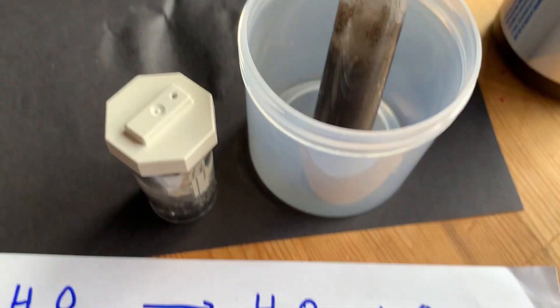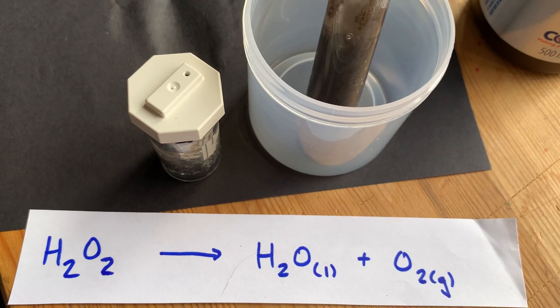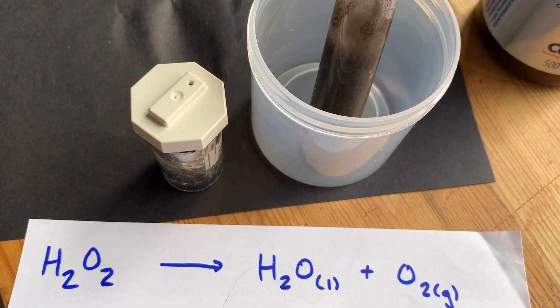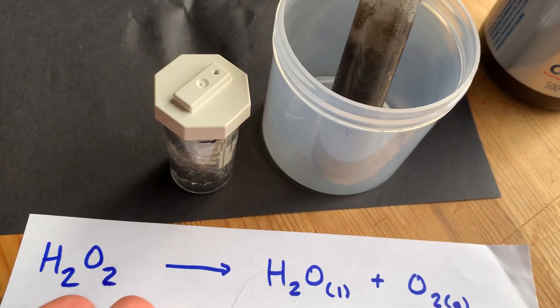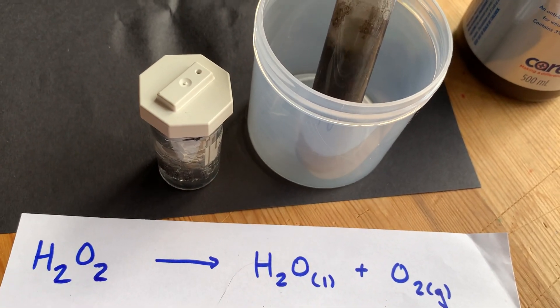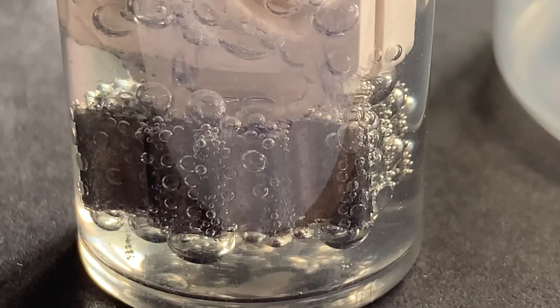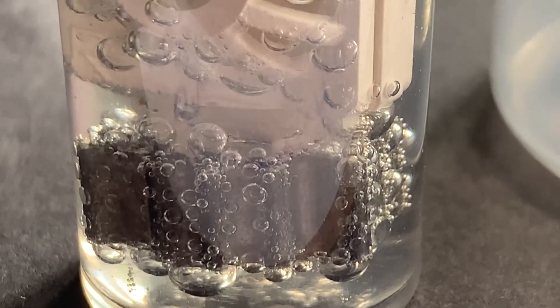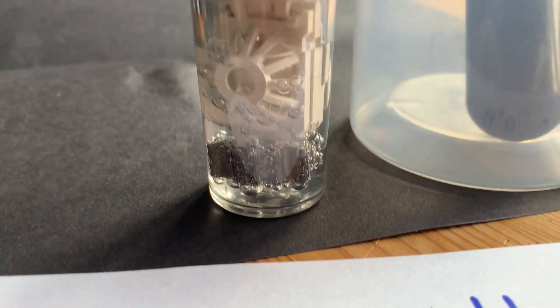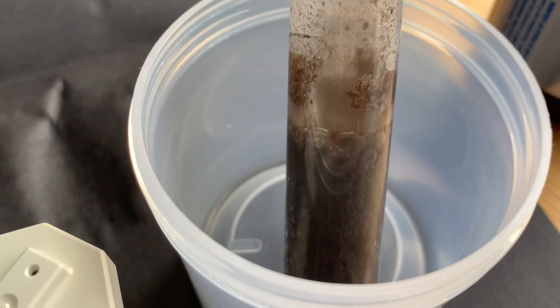So there you have it, hydrogen peroxide decomposing into water and oxygen gas, both on its own, which does proceed on its own despite the fact that we weren't able to watch that happen, being catalyzed by this metal from a contact lens container—I believe it's platinum, but don't quote me—and with powdered manganese dioxide, which is really going to town here.